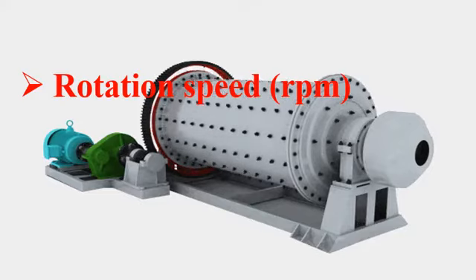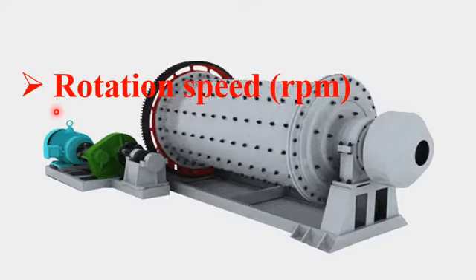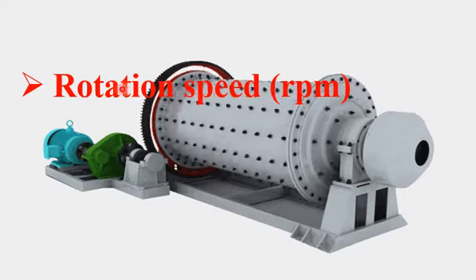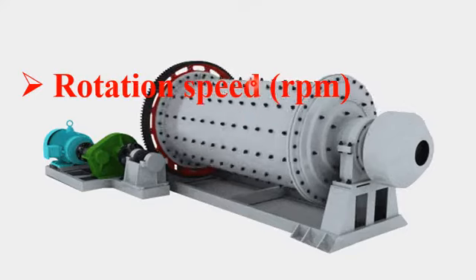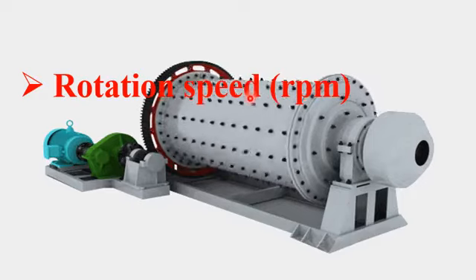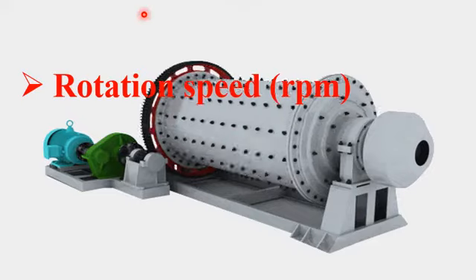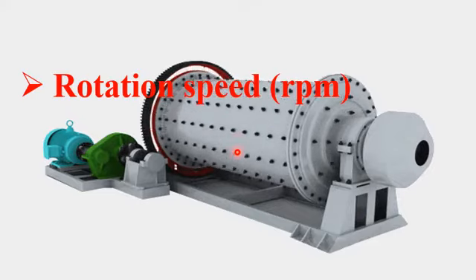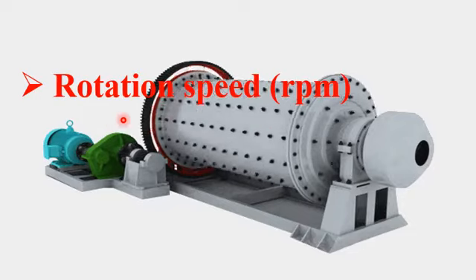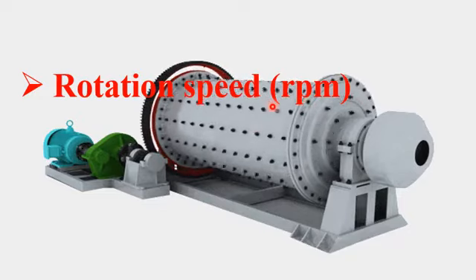So student, another key physical parameter which we need to consider in ball milling processing is the rotational speed of the ball milling drum. This rotational speed of the ball milling drum plays a very important role in crushing of the bulk material. Dear student, the rotational speed in a ball milling apparatus varies between 4 to 20 revolutions per minute.